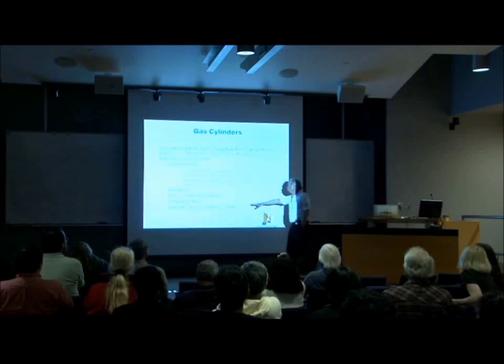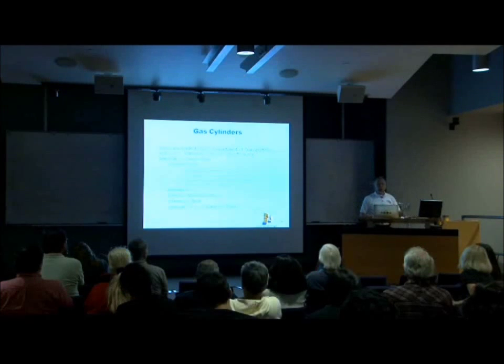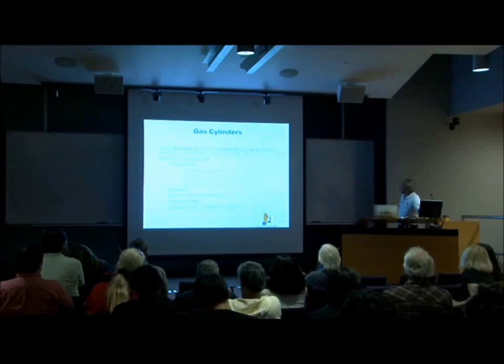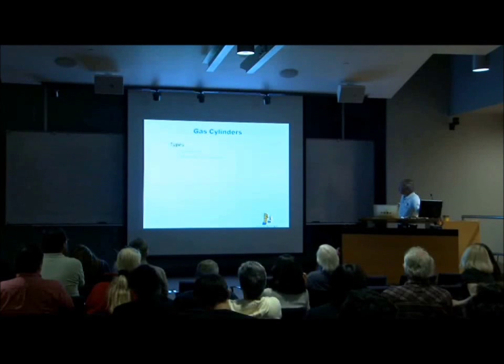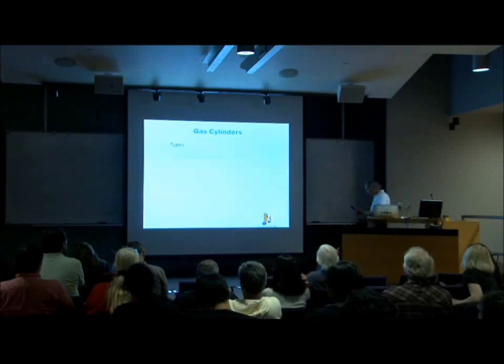There are many fluorine compounds that come in Monel cylinders because of purity. You want to maintain a very high purity, so they'll use a very expensive cylinder. Two types of cylinders, a returnable and disposable.